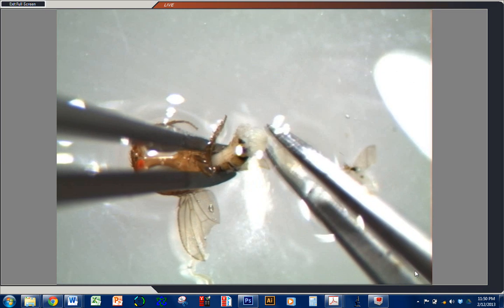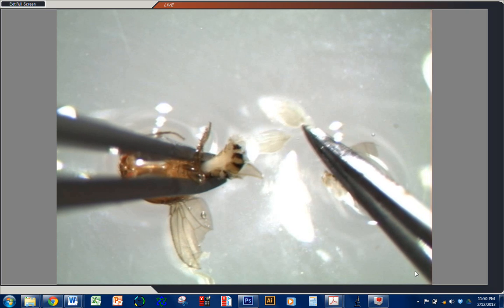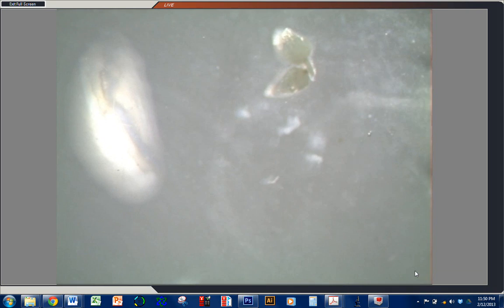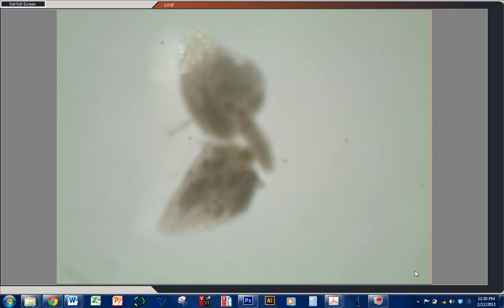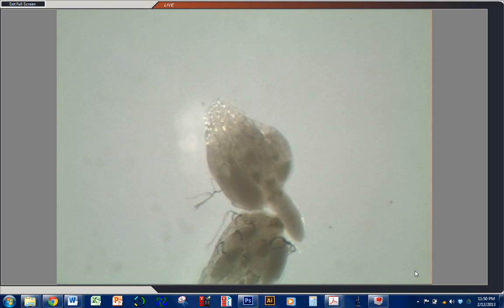Sometimes they'll come out together, sometimes they'll come out one at a time. Right now they're still joined by the oviducts, and voila — we've got a pair of ovaries here. I'm going to zoom up just a little bit and switch to transilluminated light and walk through some of the anatomy.